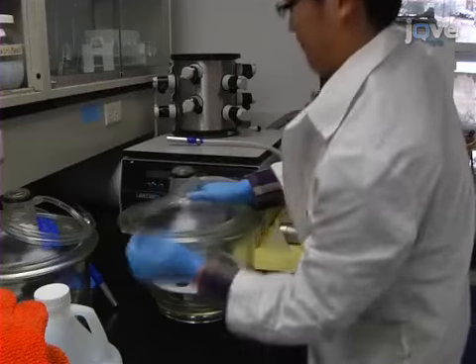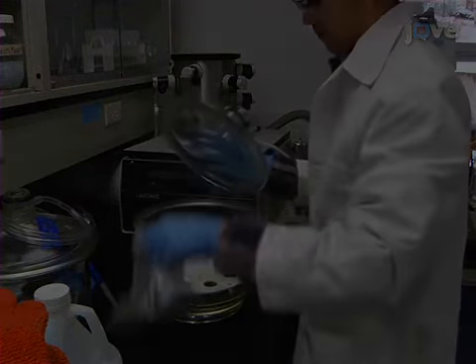To begin this protocol, freeze-dry soil samples after field collection.